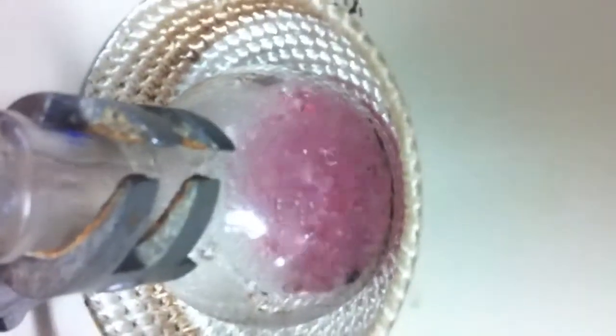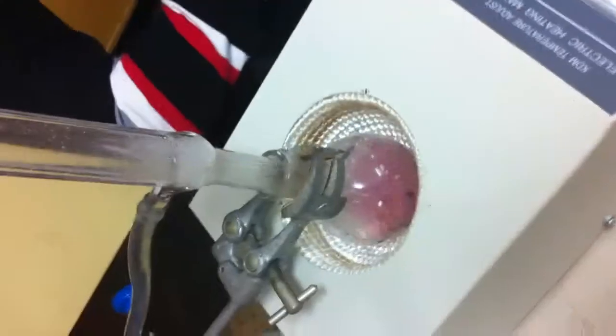Okay, wait, I think we did it right. Yeah, okay. So we're back. This is about 1 minute into it, and all you can see is the wave. 3 minutes, and it's already changed color. 3 to 5. Awesome. We'll be back soon for another look after more than 3 minutes.